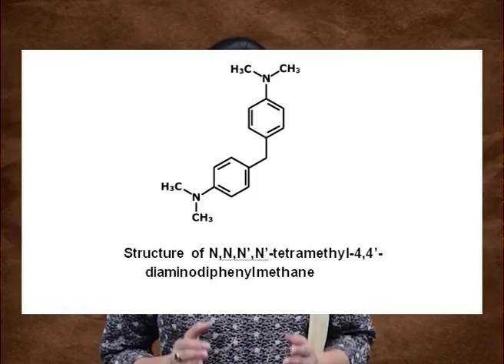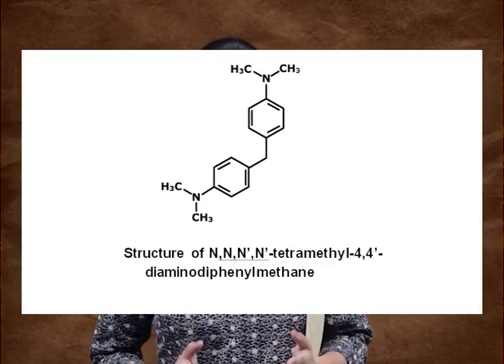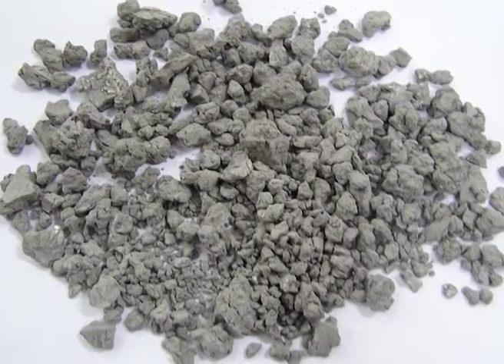The fading problem may also be avoided by pressing a silver foil onto the iodine developed finger marks. The interaction of iodine absorbed on the fingerprint residue with silver produces yellow colored silver iodide. The latter, on exposure to light, decomposes into finely divided silver, revealing the rich pattern as a stable black deposition.